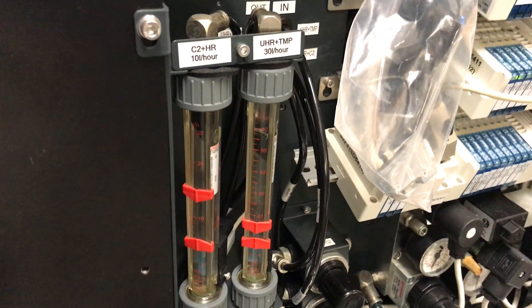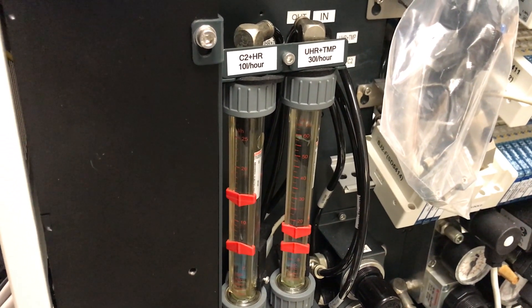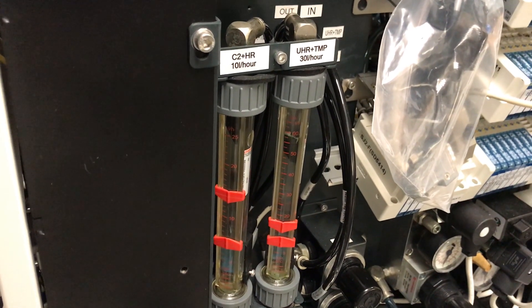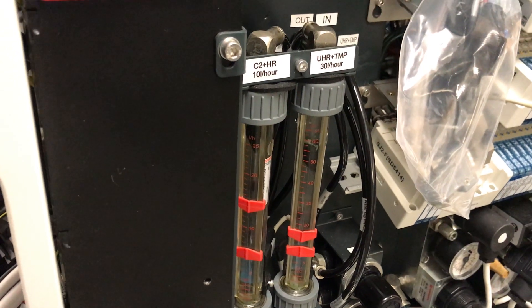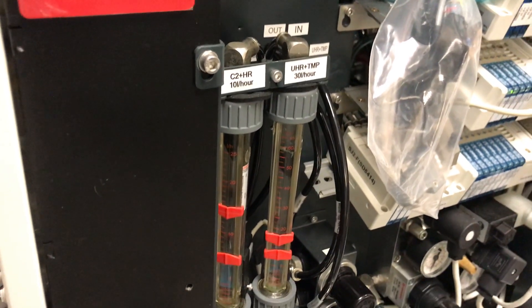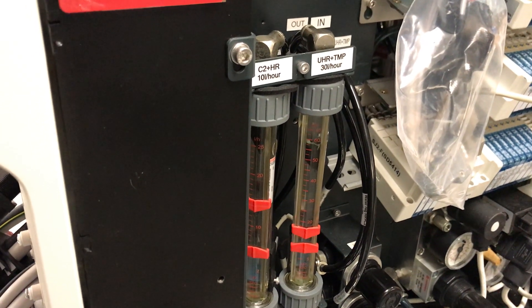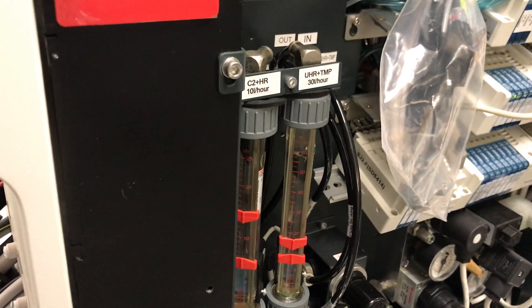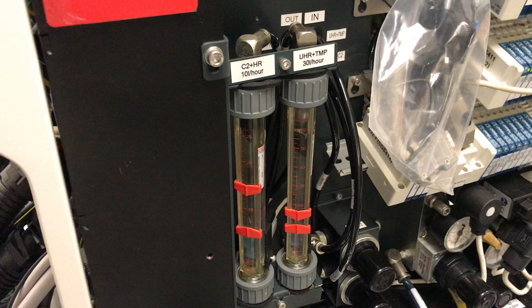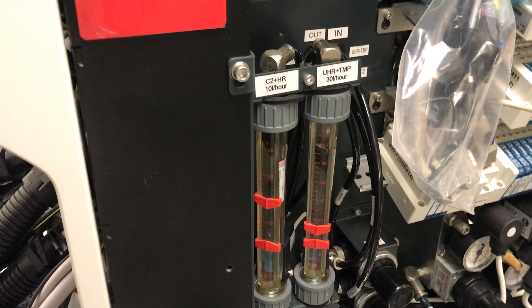So if we come over here — and this is obviously different on every microscope — on this specific one I've got the side panel removed. You can see right here there are two flow meters, and these control the flow of water through the microscope. The pressure coming out of the chiller we can't adjust on this specific chiller, but we can control the flow through the microscope with these two flow meters. This is where you have to set the flow to an optimum value so the chiller can hit the set point, but not so high that it causes potential image instability.